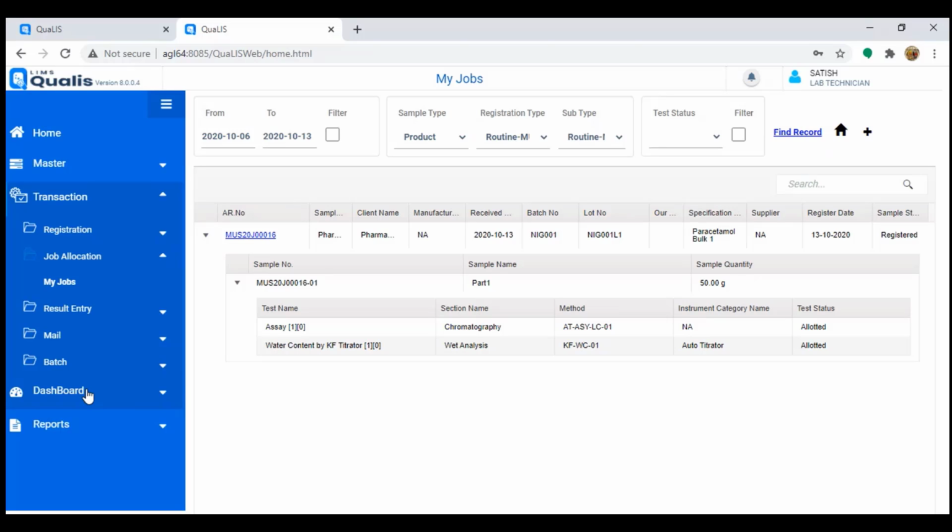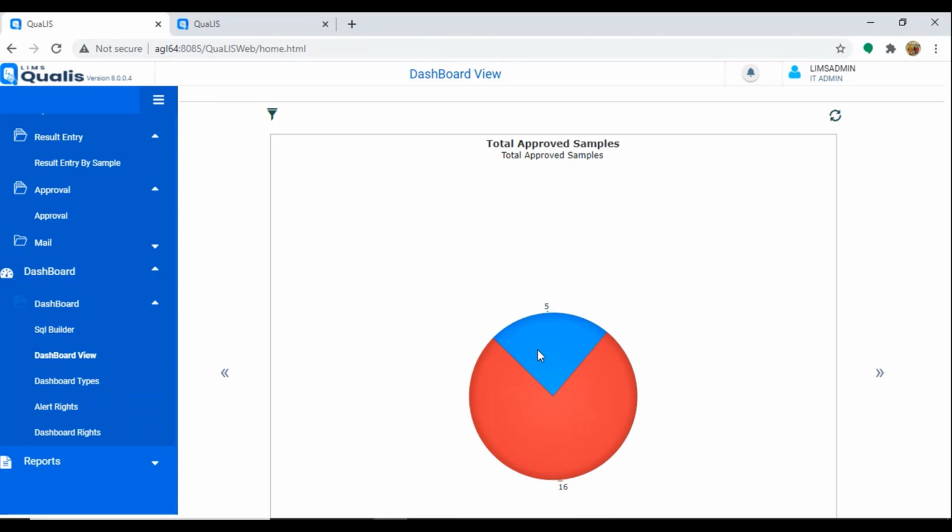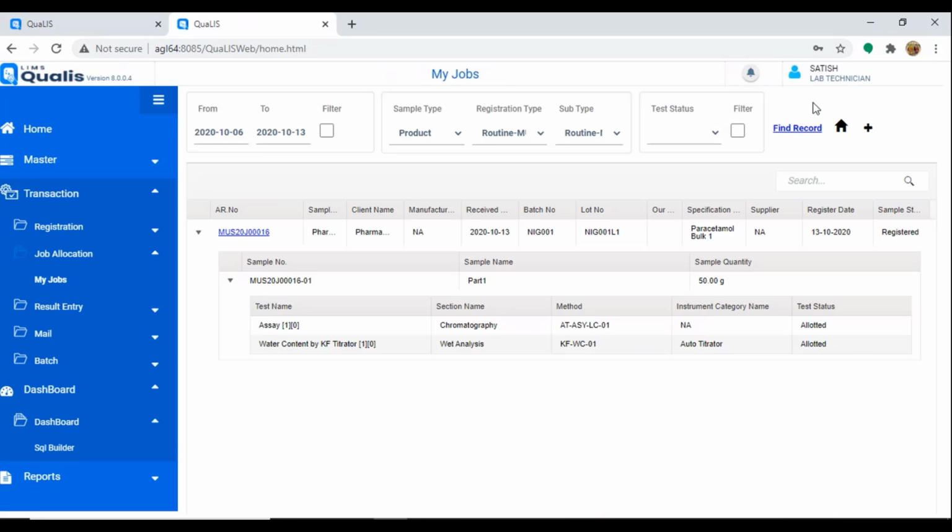It is configurable. Dashboard gives only summary. They actually see it in the alerts here. In the alerts, I have not configured anything, but they should see here a line saying 2 tests are pending. Not configured it, but it is in the alerts.